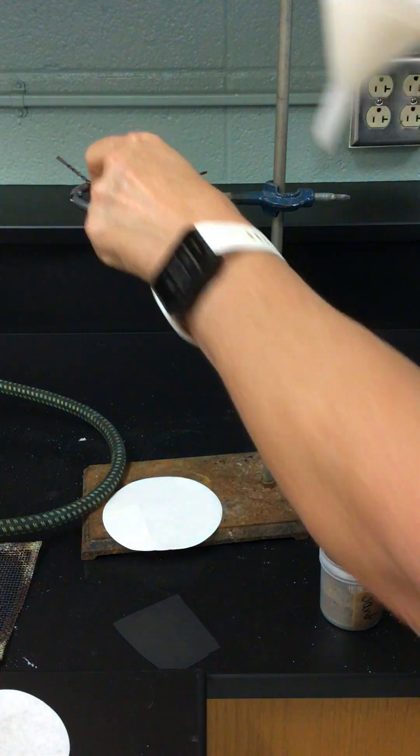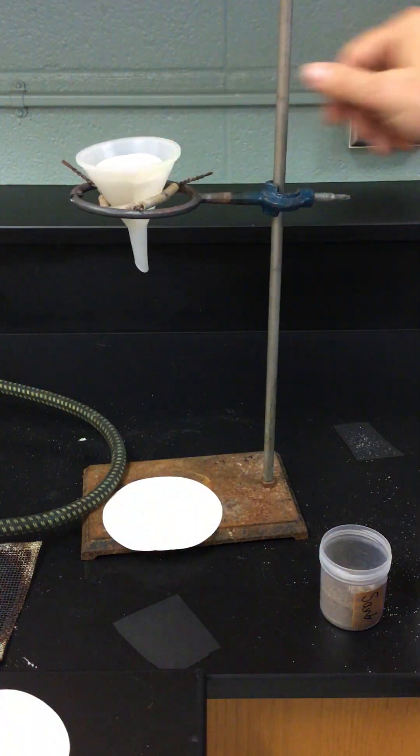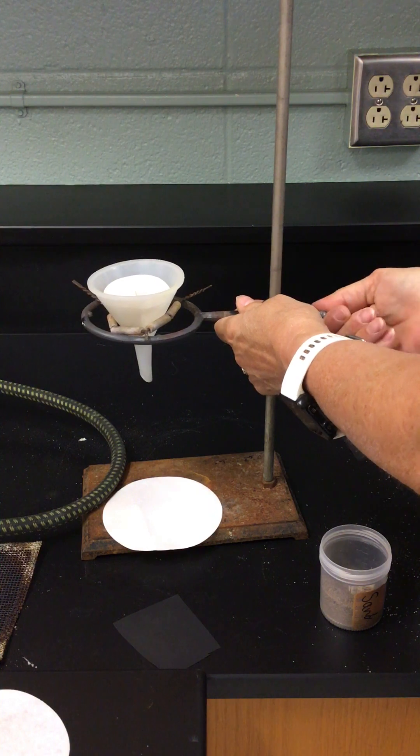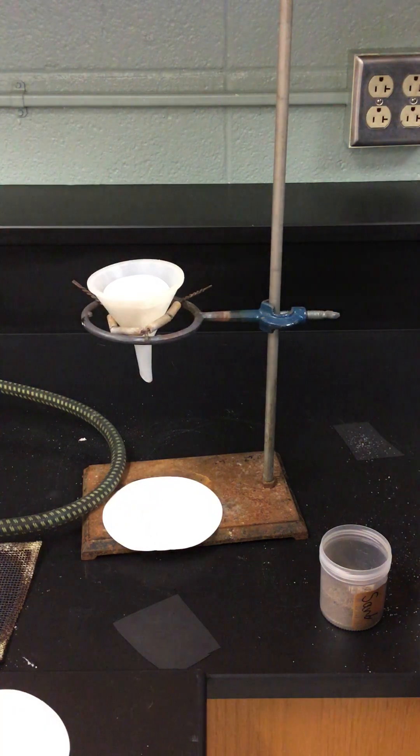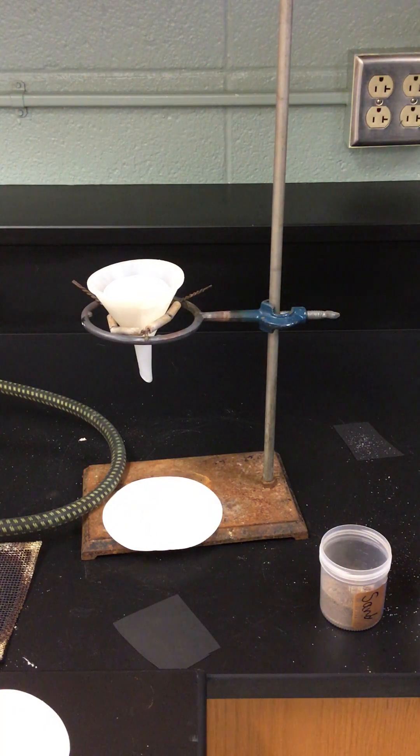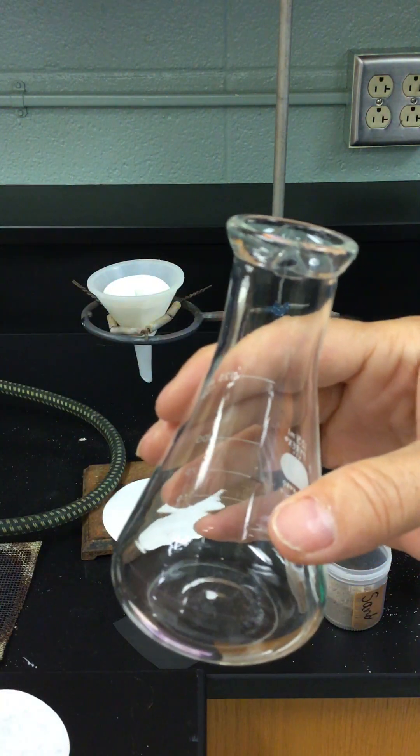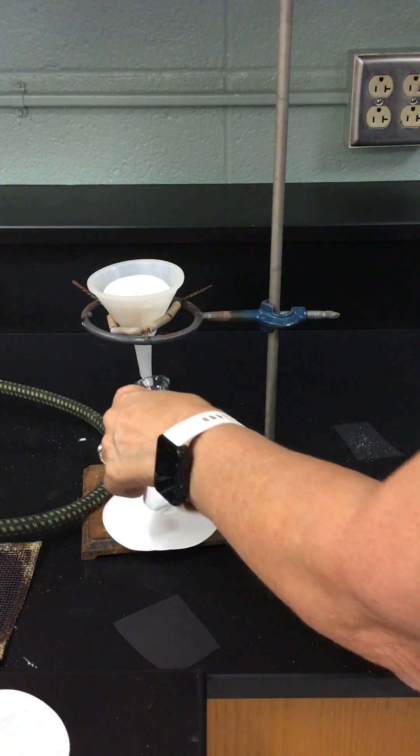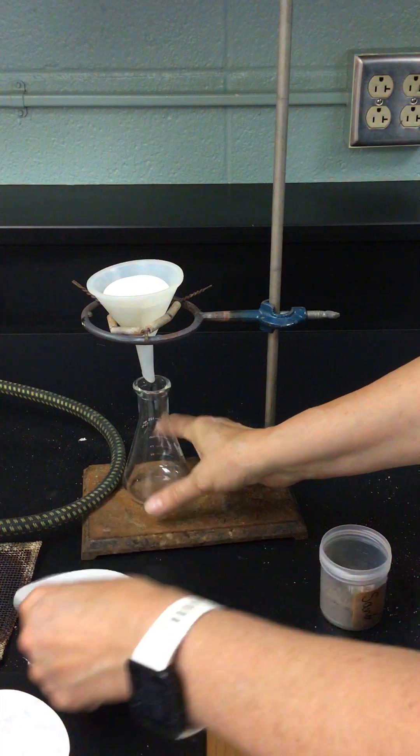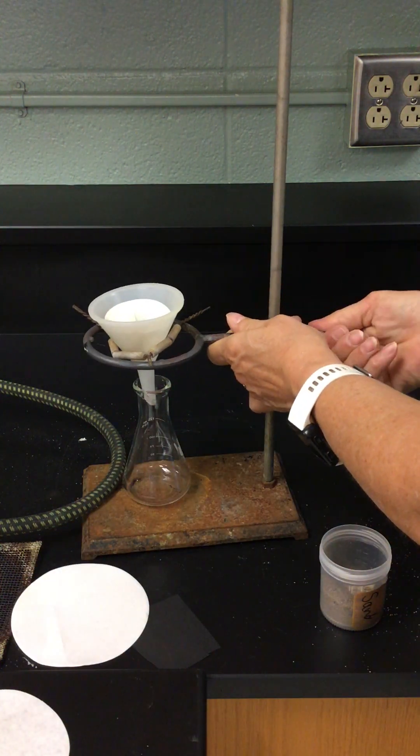Then we put it in our ring. My ring isn't big enough so I brought a clay triangle over and I'm going to get this a little lower. We'll collect it in this Erlenmeyer flask. I'm going to get this down so it doesn't drip all over.